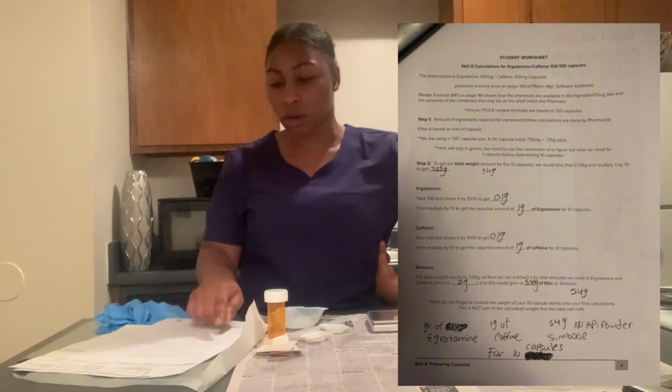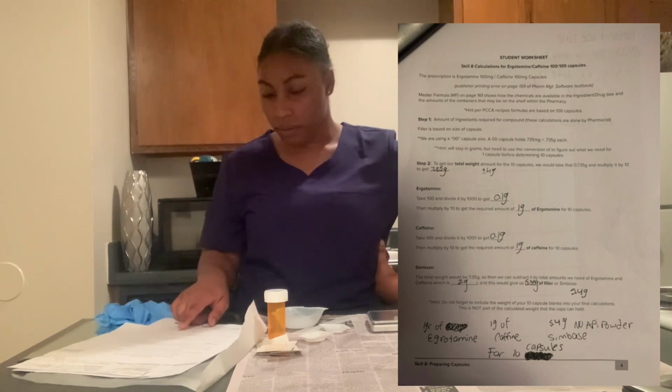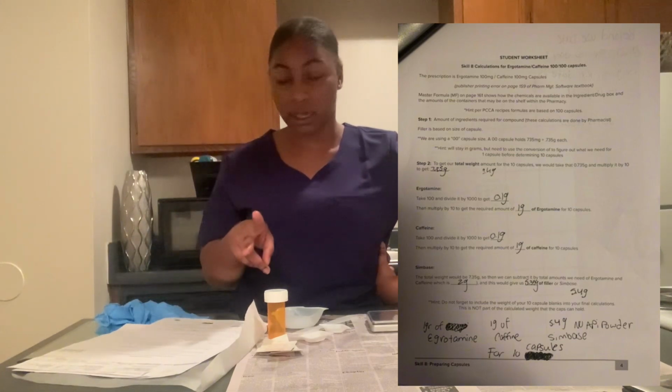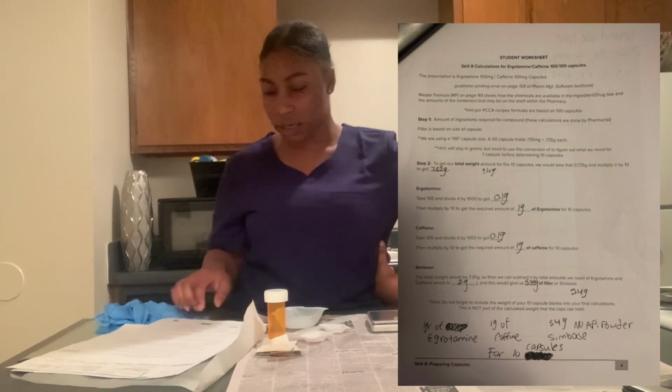We already got the ergotamine, which is 1 gram, and the caffeine, which is 1 gram. So we subtract the 7.35 grams by the total amounts we calculated in the beginning with caffeine and ergotamine. This gives us 5.35 grams of filler, or Symbase. So 5.35 grams of the Symbase is what we need.